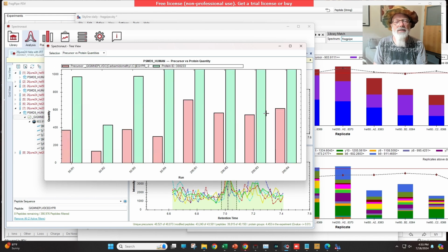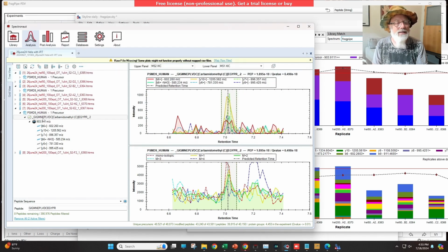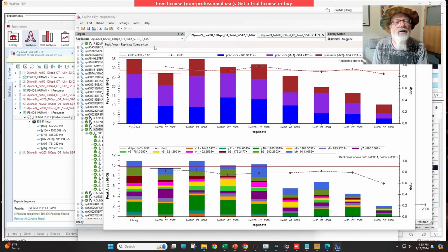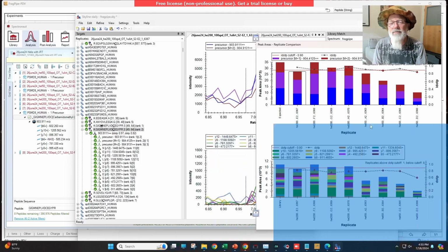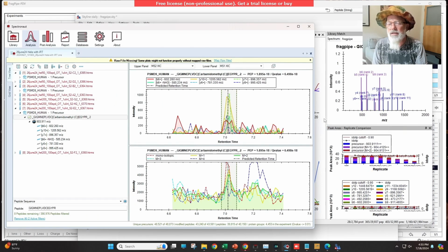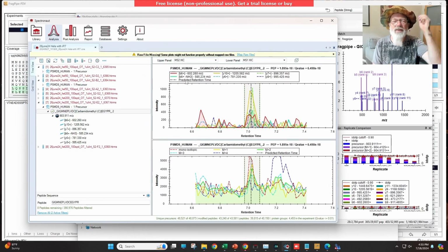You can kind of see here. So anyway, less, as you expect. So that's good. I really like the Skyline visualization. It's very, very pretty. Okay, so you can move windows around, dock them places. Here. Let's see. So you can see they're kind of 7 minutes. 7 minutes. Found the same thing.